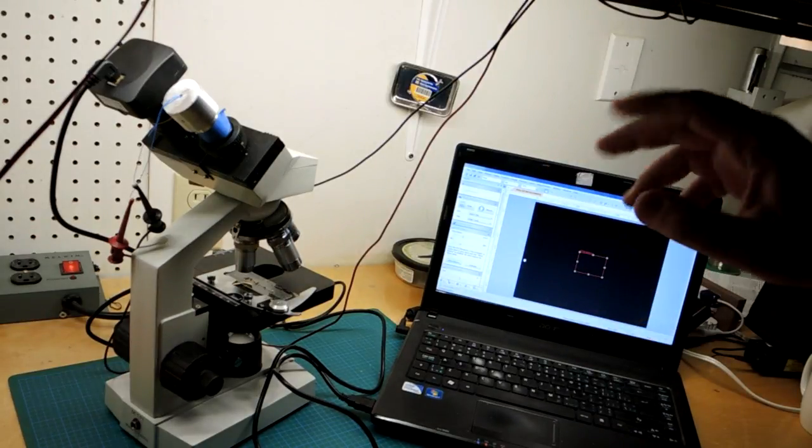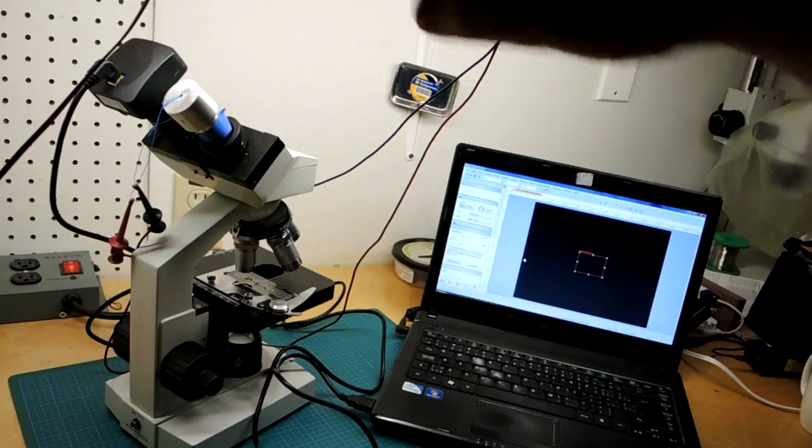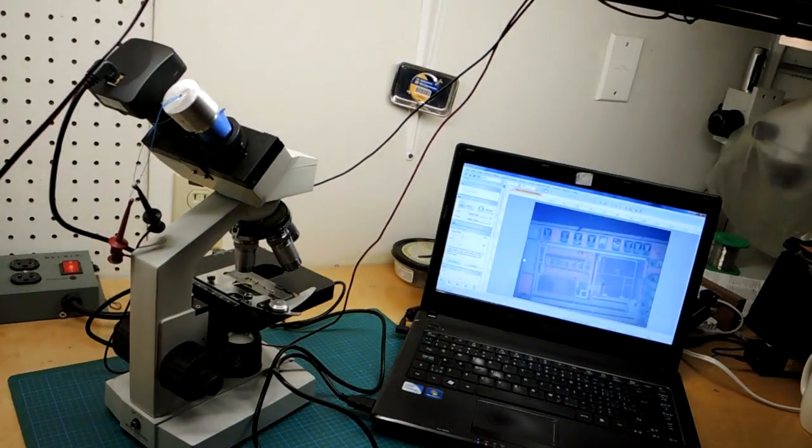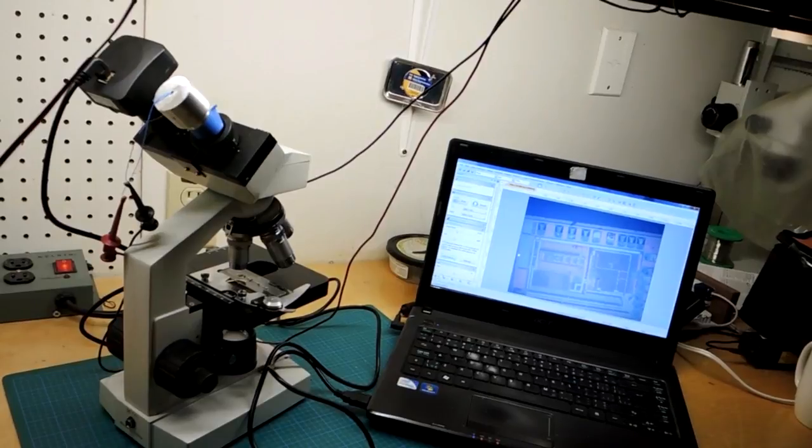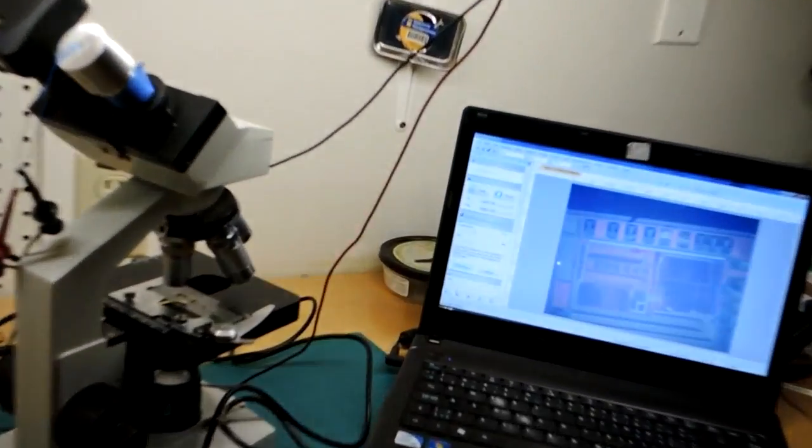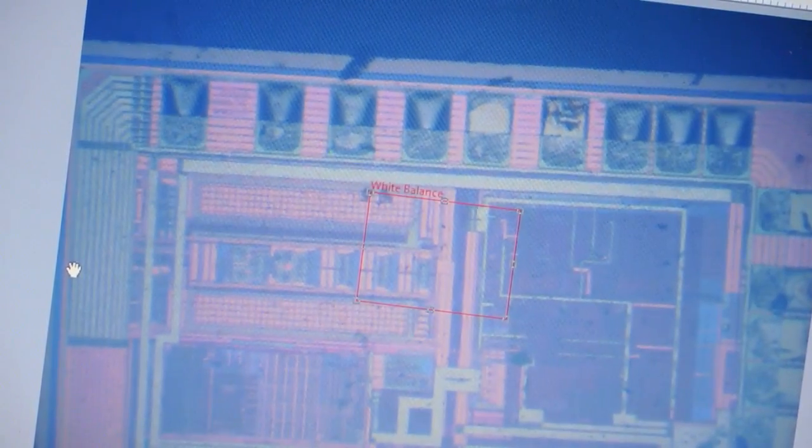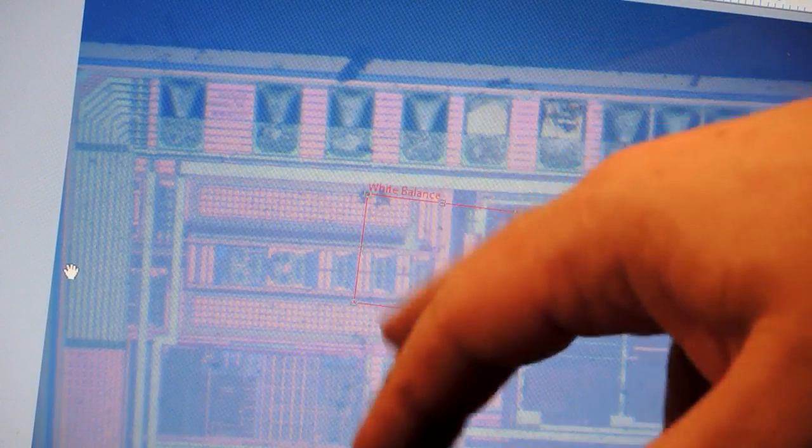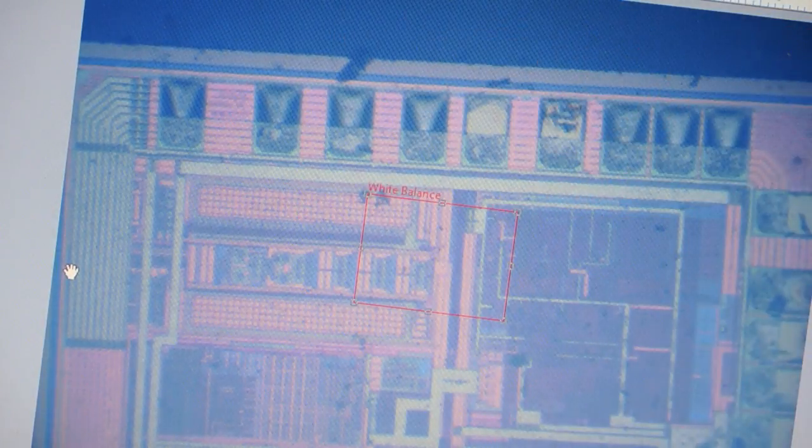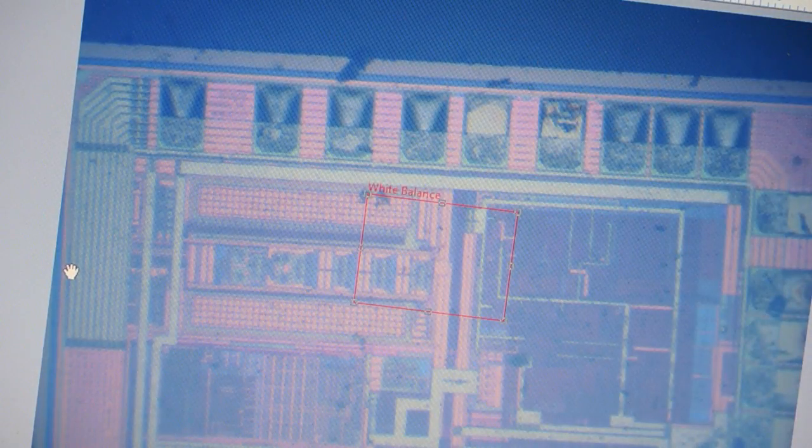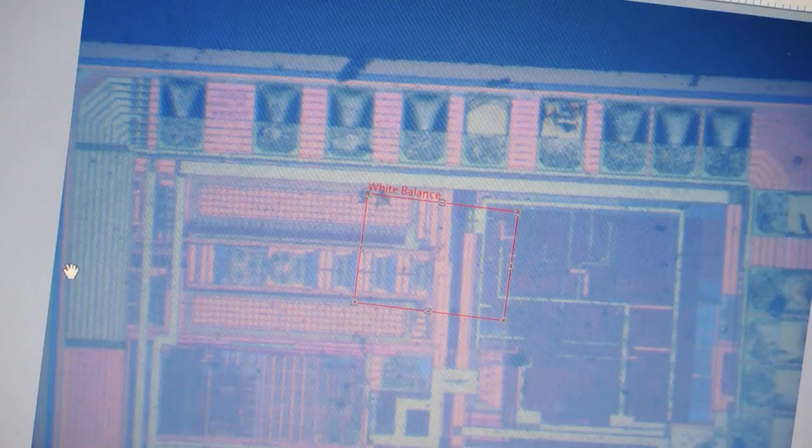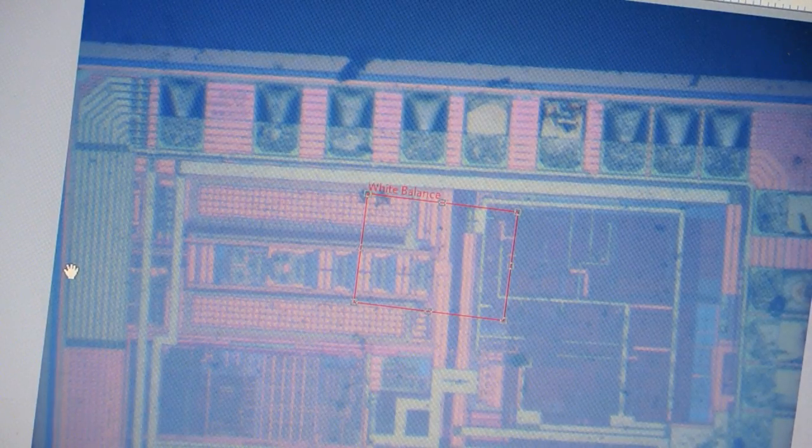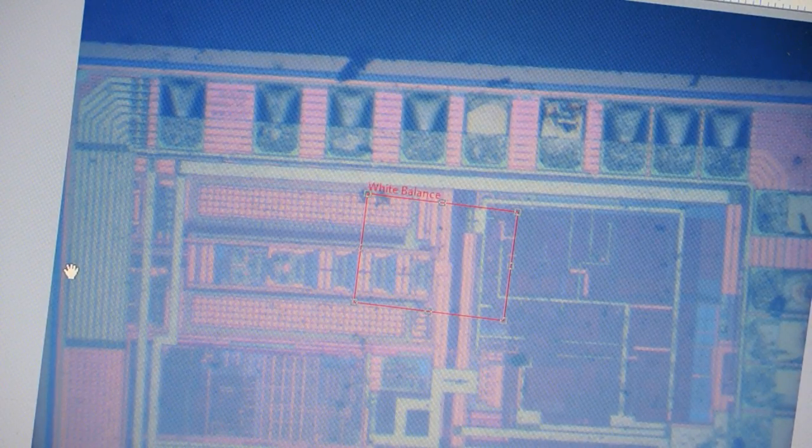It's black right now because there's no light. Now if I turn on the power supply you can see that the camera can now see the die and let me just zoom into that. Here's a lovely picture of the die and all of its details. And this is what I wanted to do, basically to illuminate opaque samples. So it looks like I have a reasonable solution for topside illumination and I have a poor man's metallurgical microscope.